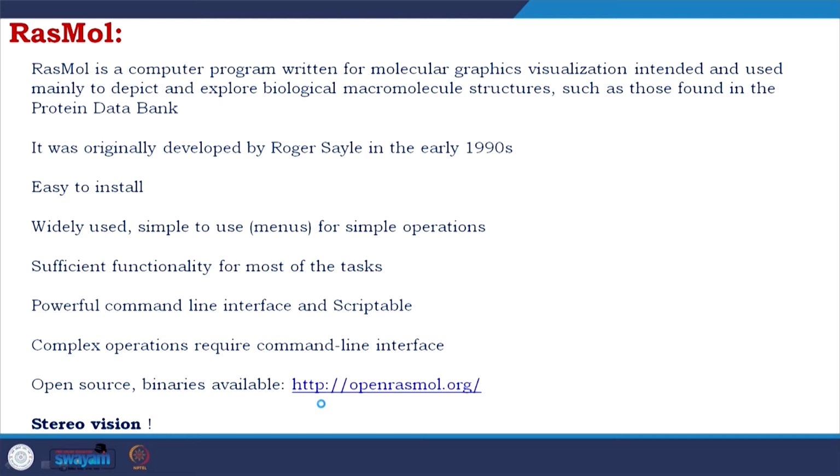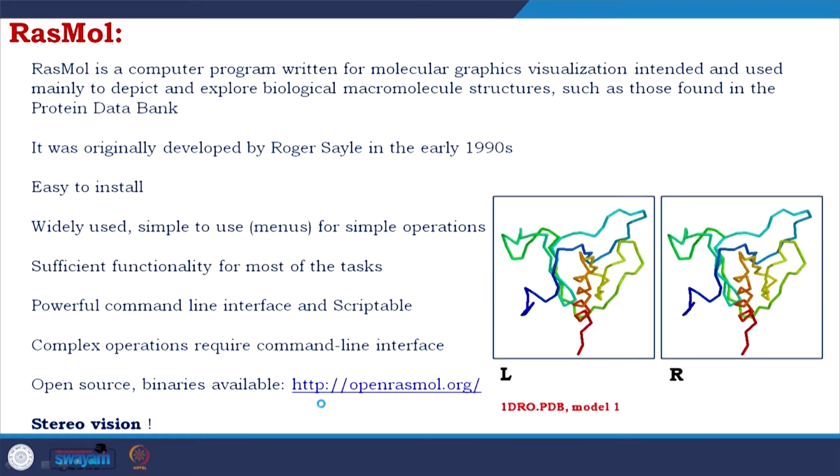Also, one of the strongest things is having stereo vision. This is the presentation you see of the PDB 1DRO, and the presentation has L and R, so a stereoscopic presentation.